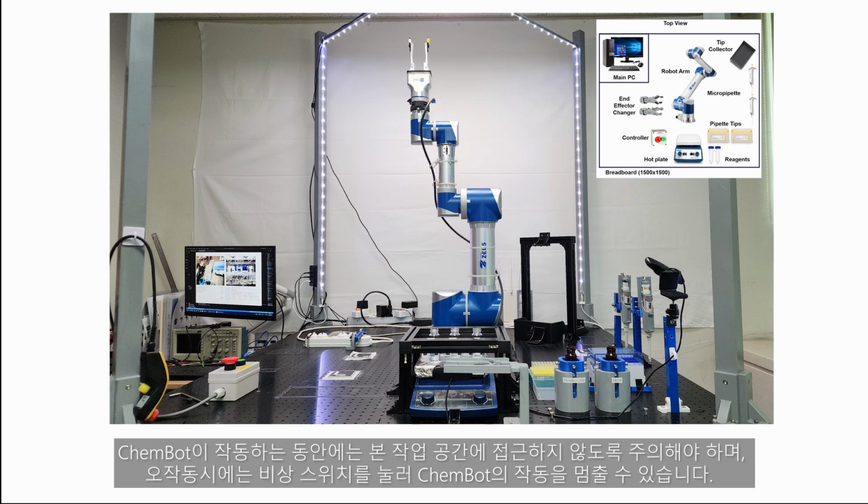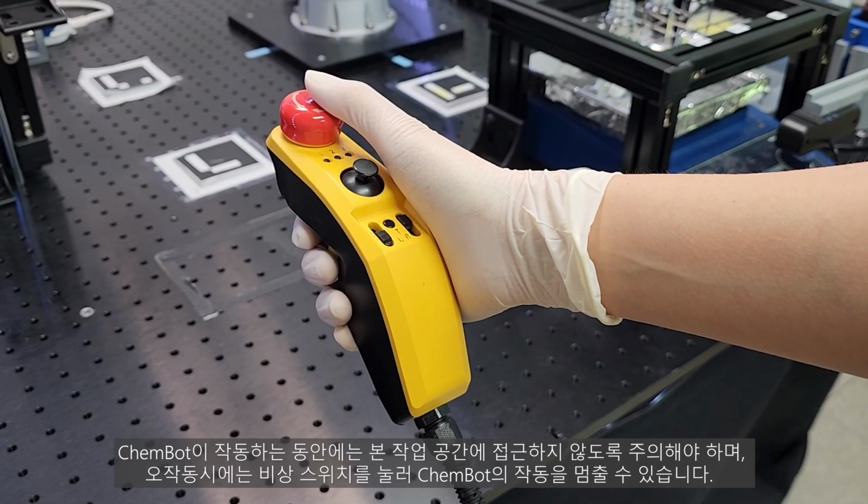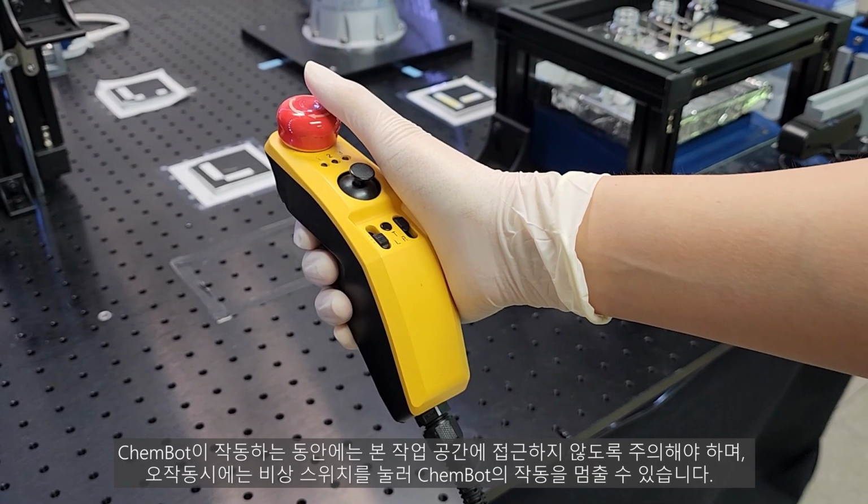Care should be taken not to access this workspace while ChemBot is operating. In case of a malfunction, you can press the emergency switch to stop ChemBot's operation.